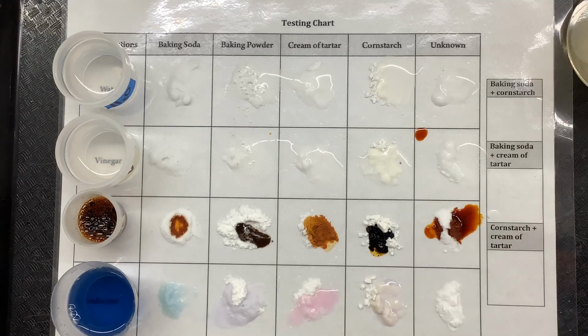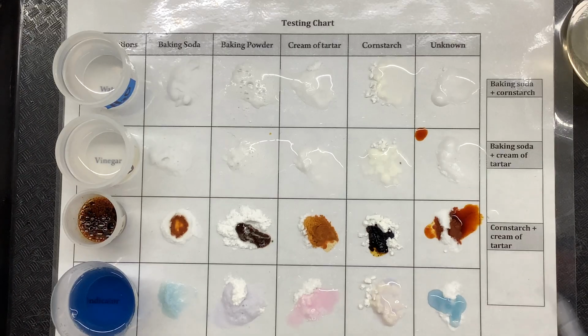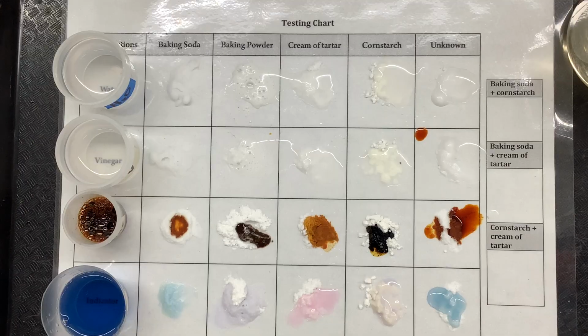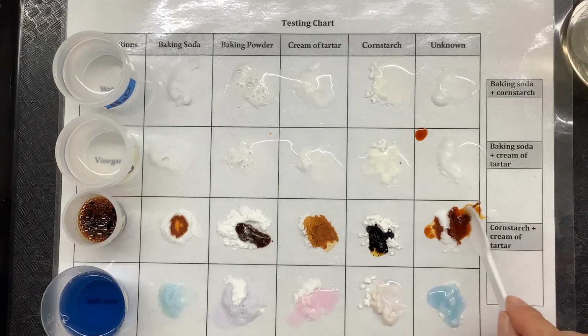Okay. I think we're ready to do our indicator. There we go. What's it going to do? Oh, look at that. Okay. Cool. So we did all our tests. Look at this. This color now is different. It's kind of changed.